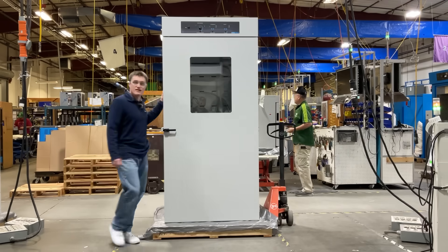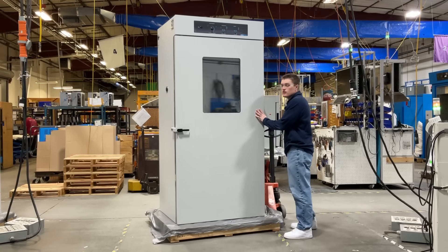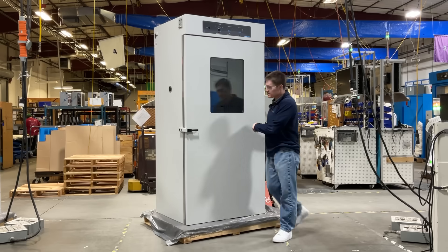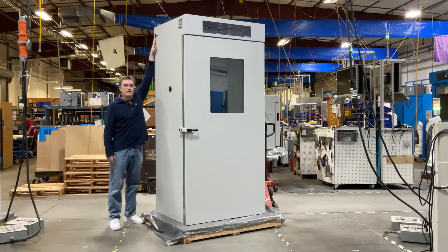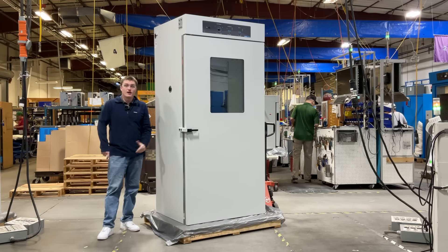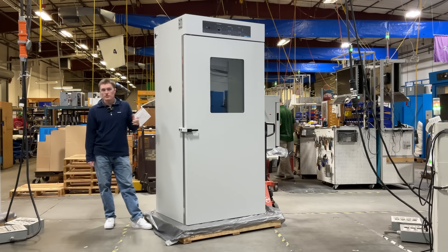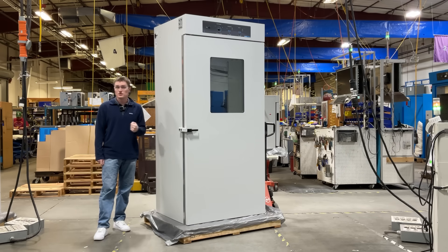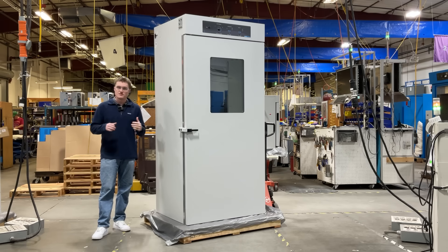Let's take a look at the left side of the unit. The first thing you will notice in the upper left corner is the main power inlet. This is where you connect the power cord included in your ship kit. One thing to note is that these units must be connected to a properly grounded power supply. For information related to further electrical safety, as well as installation instructions including clearances, please visit your user manual.